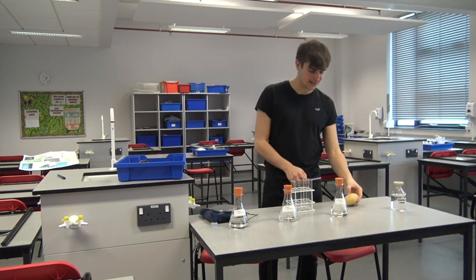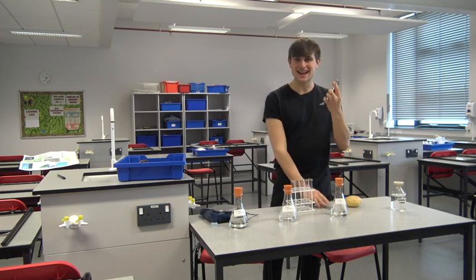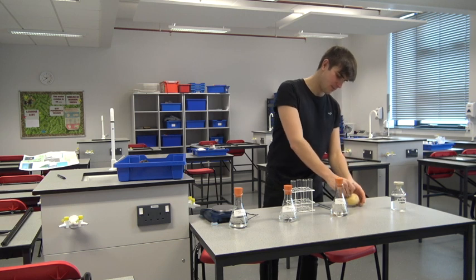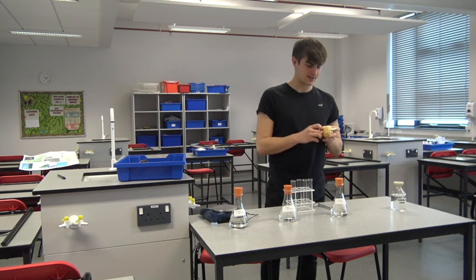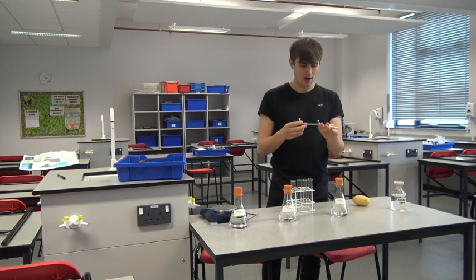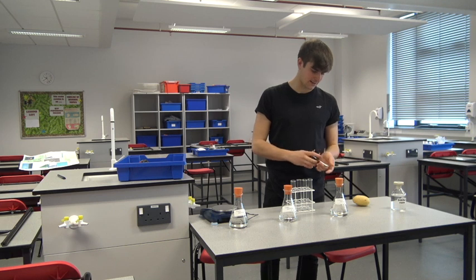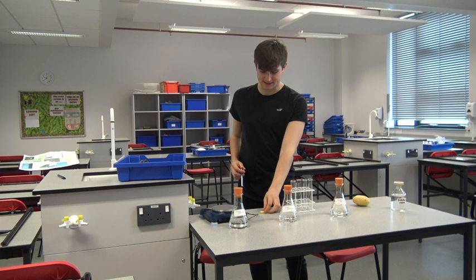The first step we need to do is create equally sized potato chunks. We've got a little cutter here and it's really important that the potato chips have the same surface area. That is why I am using this potato cutter — each one of the chips will have the same surface area. I just pop it out like that and then I've got my potato chip.